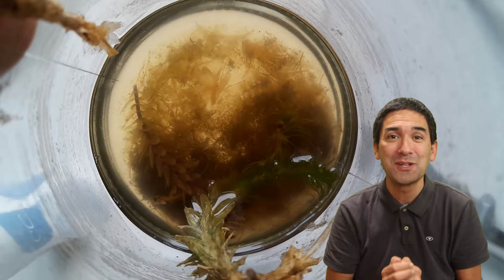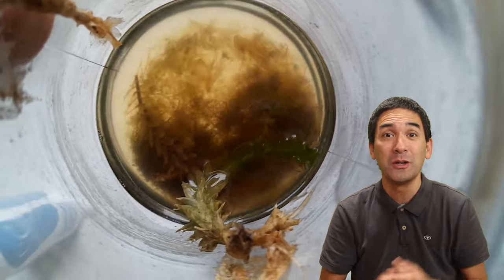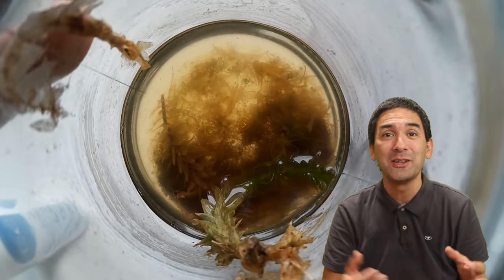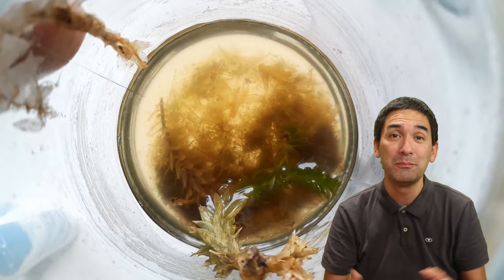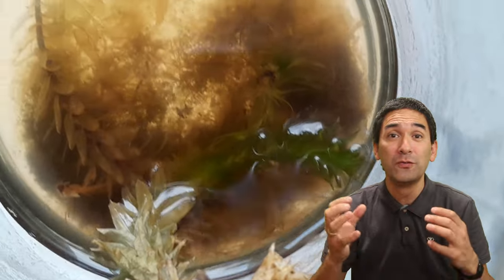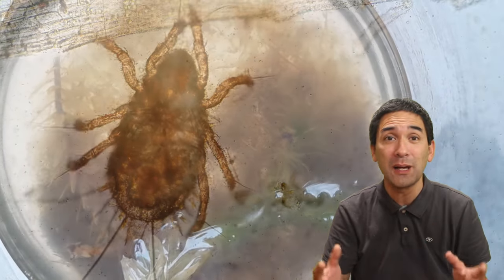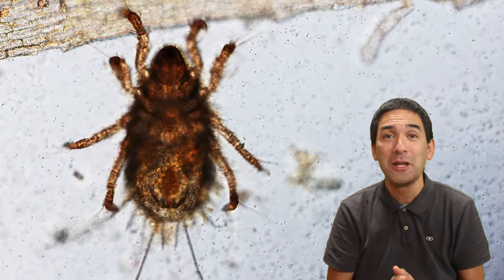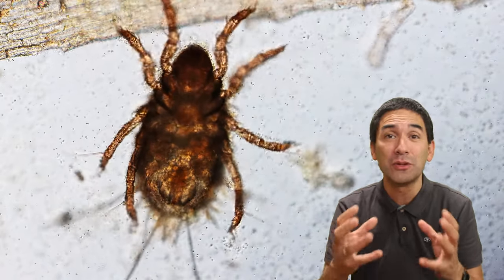This here is the water sample that I used — it's a jar with algae and decomposing plant material. It's been standing on my windowsill for probably a few months already. I always replenished the water when too much evaporated. I took a small sample and it was full of mites of different types and shapes. This one over here is a little bit more hairy-looking, whereas others were a little bit rounder and more smooth.